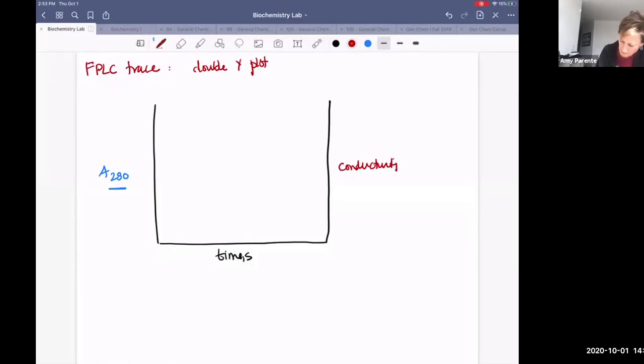And that's going to be a red line. So I'm going to map some important points on here, times where we do something different in our experiment. We changed what we did at 3 minutes, at 13 minutes, at 19 minutes, and then we were done at 25 minutes.